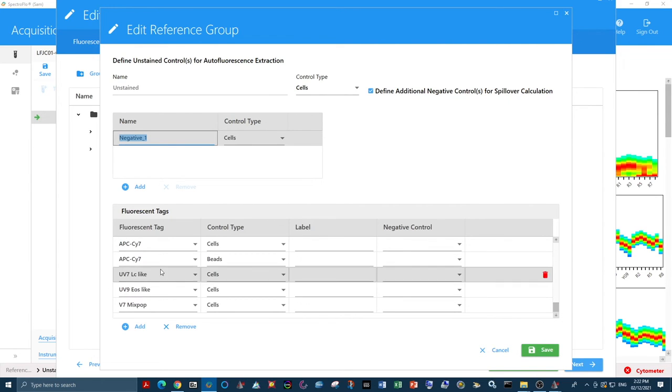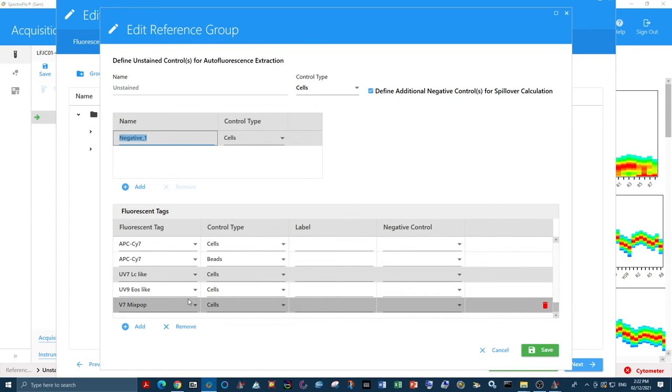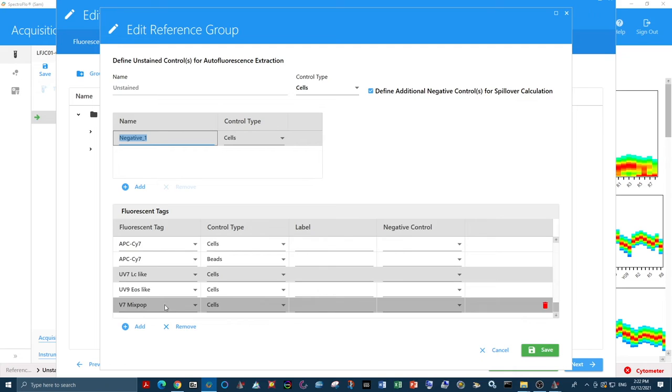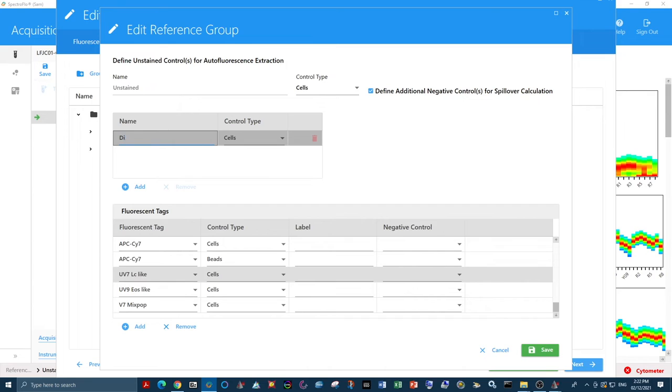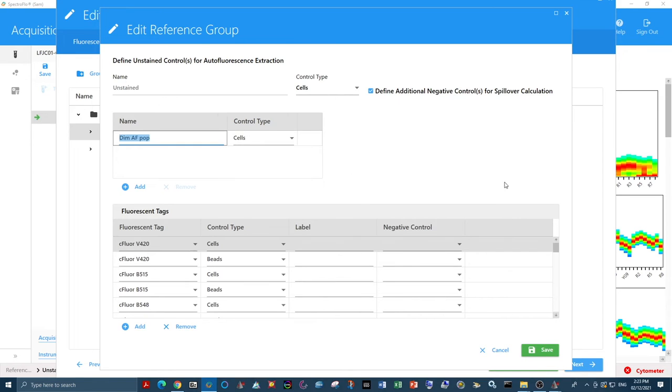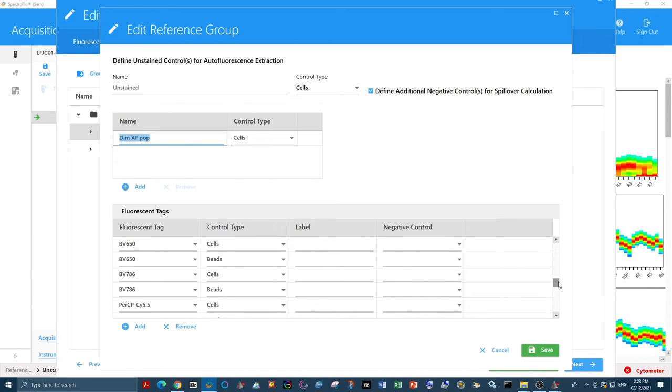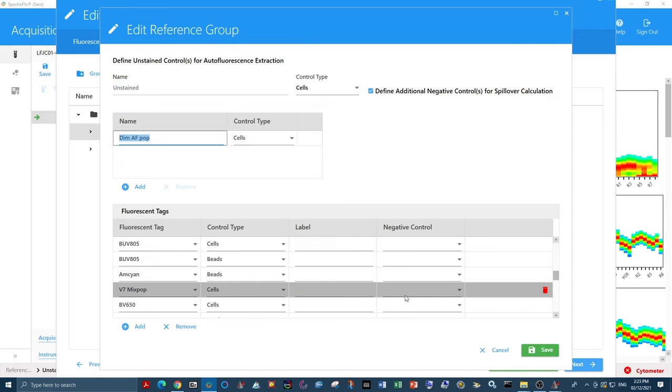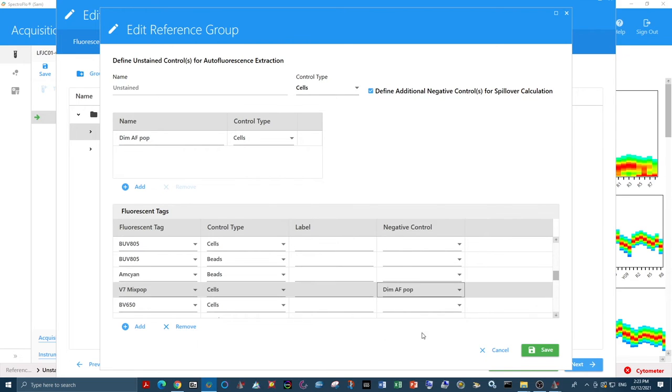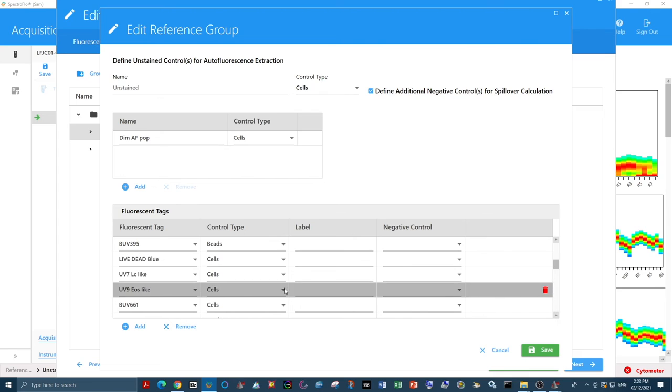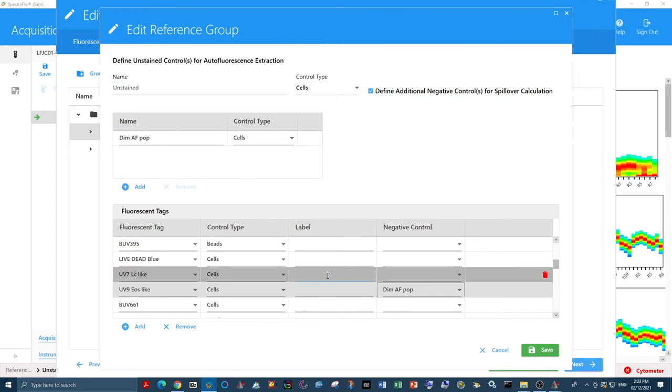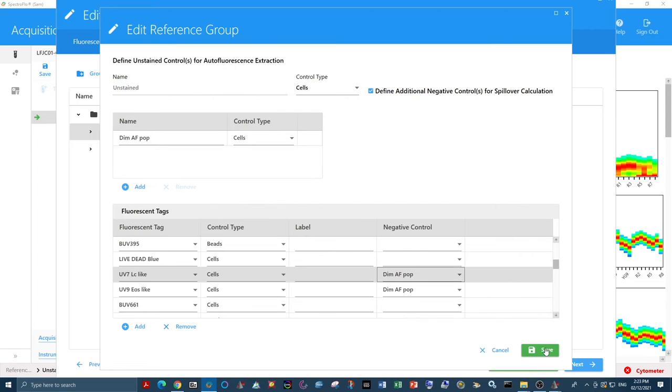Now we need to define an additional negative control for spillover calculation. Because the populations that we just exported are only positive, we only exported the brightest events in these populations. So to unmix, we of course need a negative. That's where our dim autofluorescent population comes in. And of course, we need to designate this negative control for our tags that we just put in.